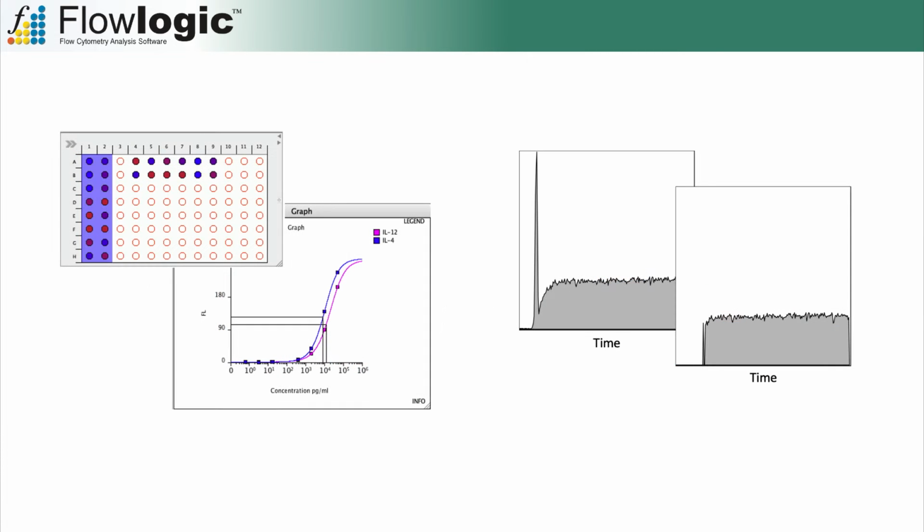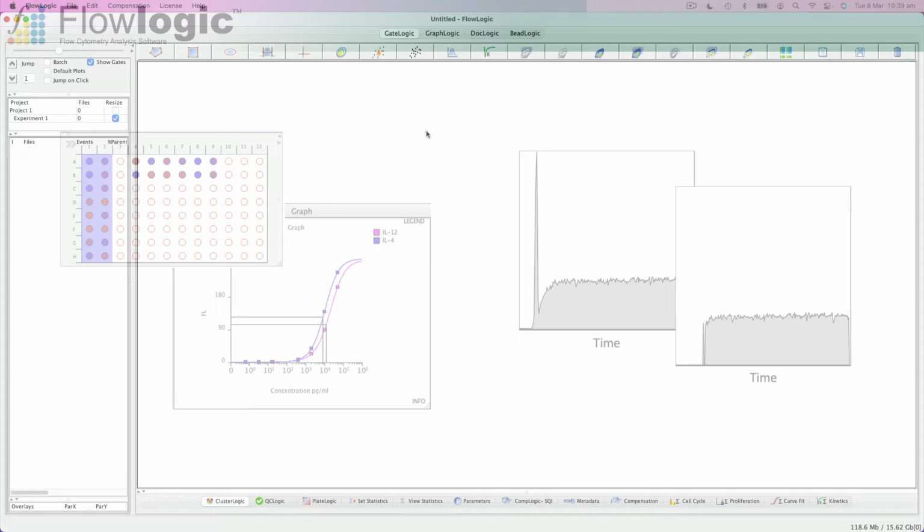It is also possible to determine the EC50 or IC50 following a regression analysis, and a QC check can be performed to identify any potential differences in the saved compensation matrices or differences in the PMT voltages within a dataset. It can also be used to extract events recorded at an optimal flow rate.